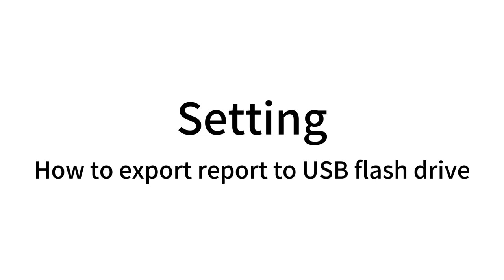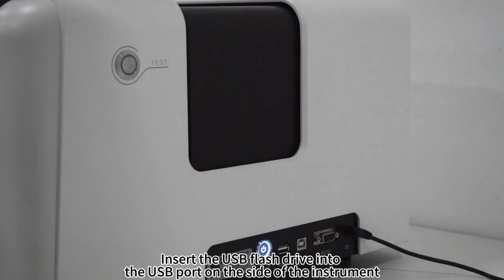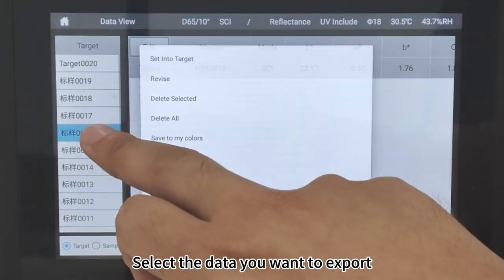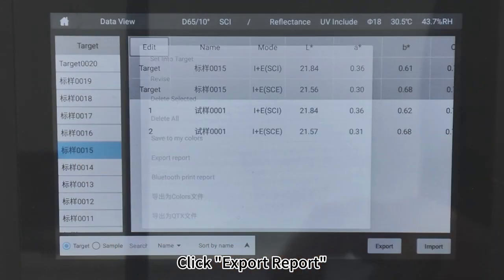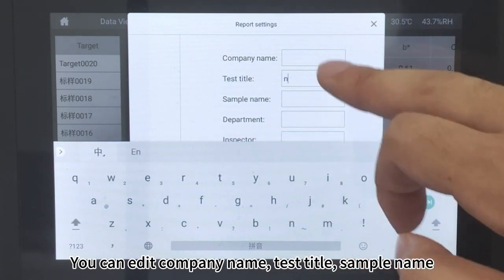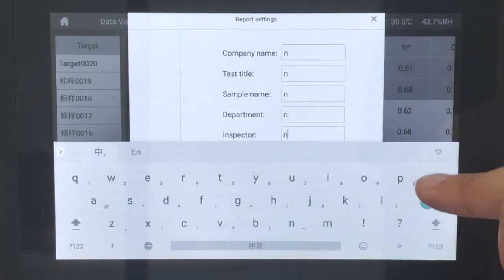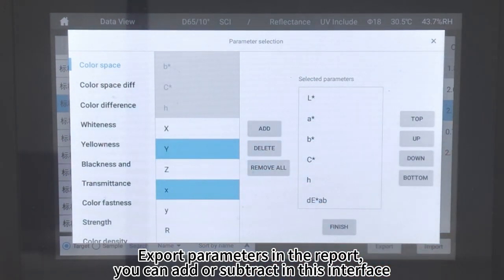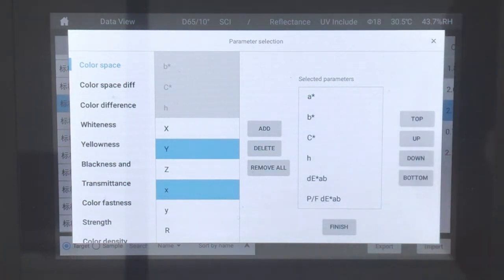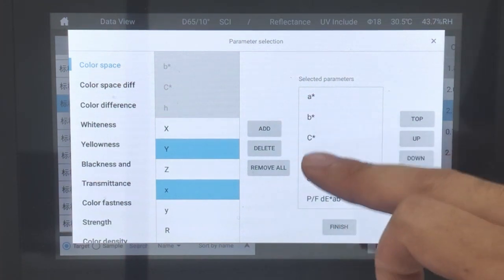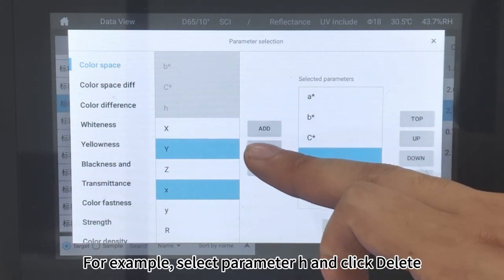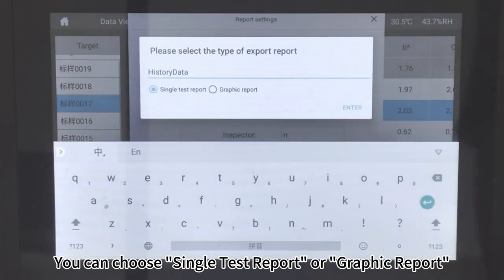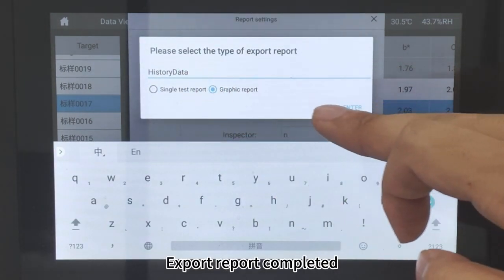How to export a report to a USB flash drive: Remove the USB flash drive from the instrument storage box and insert it into the USB port on the side of the instrument. Click Data View and select the data you want to export. Long press the data, click Export Report, and edit the company name, test title, sample name, department, and inspector. Click Parameter Setting to choose which export parameters to include — you can add or subtract parameters in this interface. For example, select parameter H and click Delete, or select Y parameter and click Add. Click Finish, then click Export. Choose single test report or graphic report and click Enter. Export report completed.